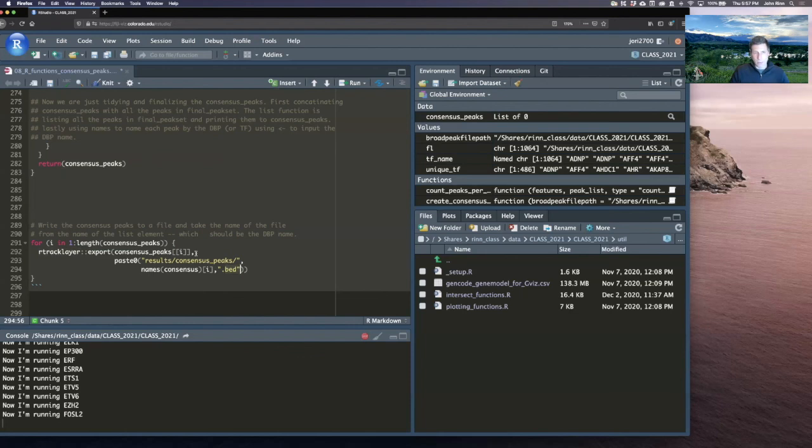Just a refresher from when we went over this in the UCSC lecture: a .bed file is simply at least the chromosome, start, and stop of where a peak is. Each of our peaks within each file has, let's say there were 10,000 peaks that merged, 10,000 entries where each peak has a unique start, stop, and chromosome position. Okay, and that's also just simply our track layer export.